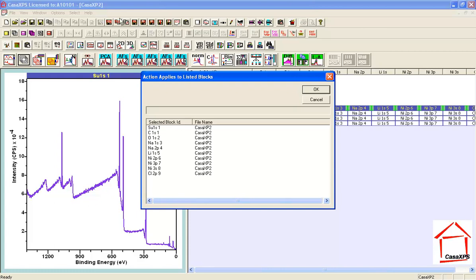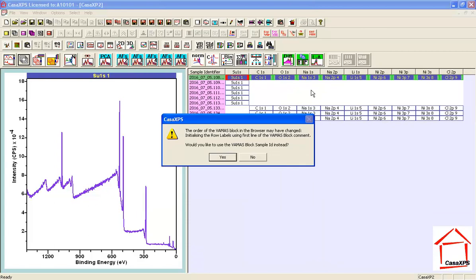I can see that the file name is the one I'm targeting, and the block IDs are as I see. So having confirmed that these are correct, I press OK.